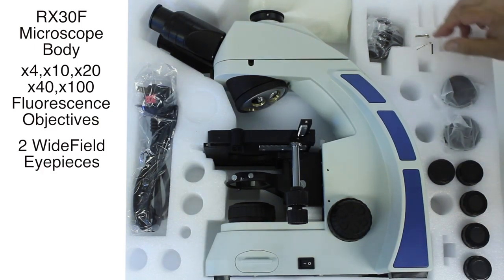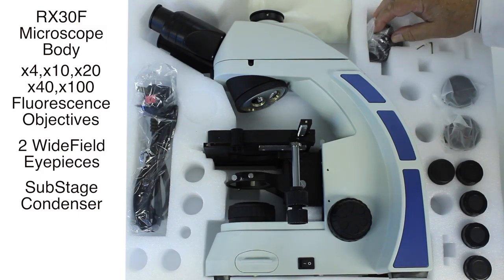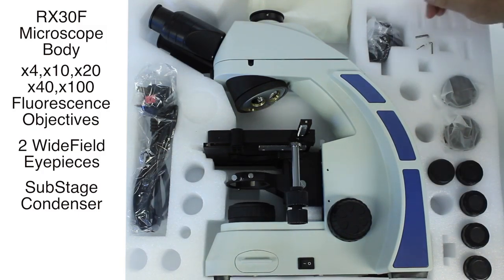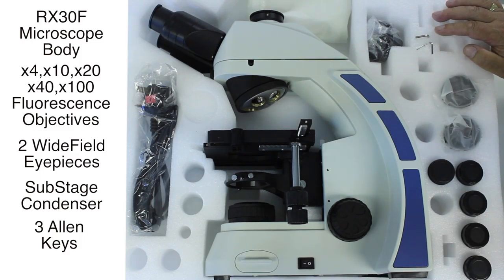Two wide-field eyepieces, the substage condenser for the bright-field transmitted light, and the three allen keys which we'll need a little later.